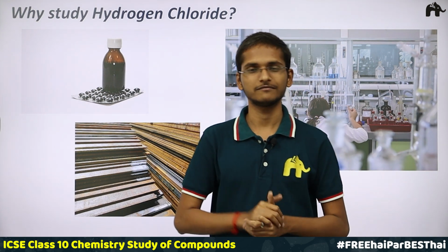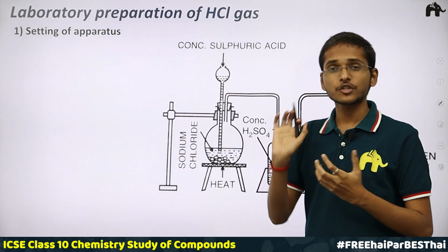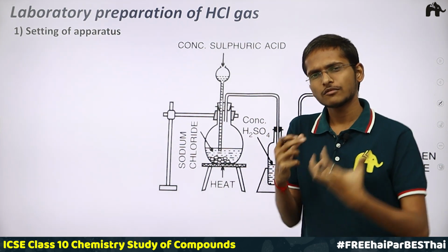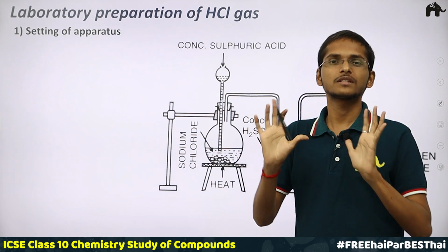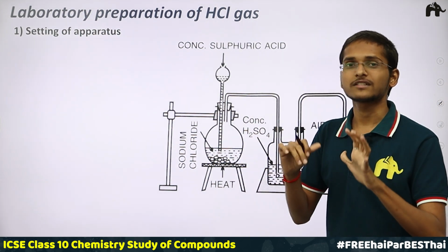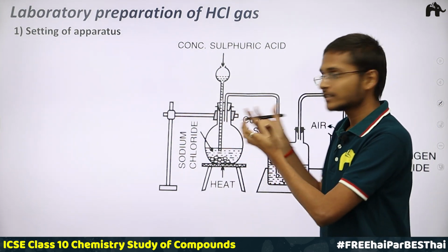So then let's start. So now we are going to learn this laboratory preparation of HCl gas step by step, in a stepwise manner. And we are only going to study those things in this preparation which are in your syllabus, strictly sticking to your syllabus. So first one is setting of apparatus. Now also we are going to learn it in a way that, yes, we are actually doing this experiment.